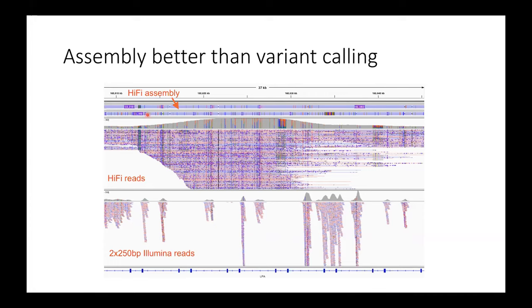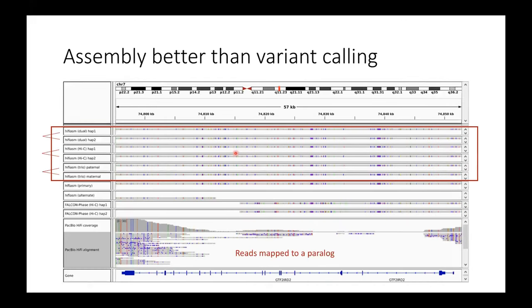And so you know what's really happening here is not only did the copy number change, you know where this insertion happened and what's the length. And you also get phasing information, instead of just seeing a whole pile of reads. And so here is a second example.